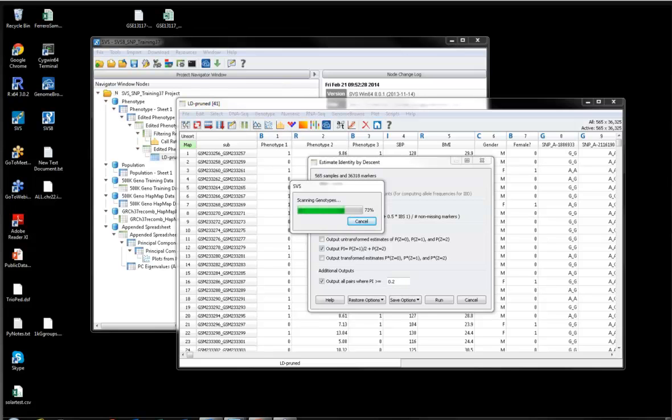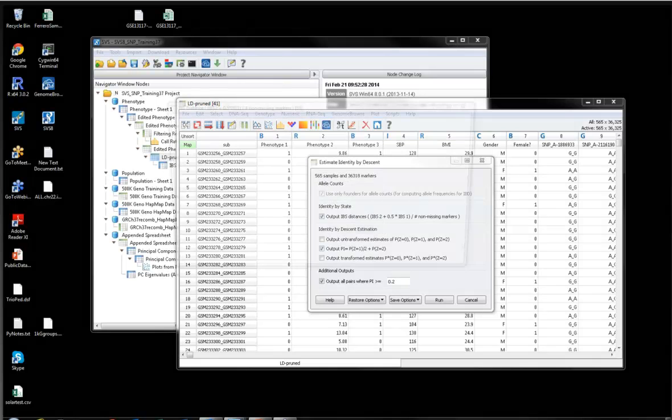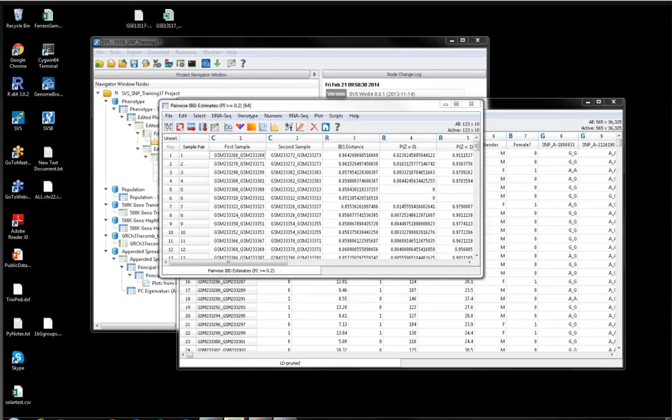But if you have data that's in Excel or in SPSS or SAS or other statistics programs, we can usually read those directly as well. I'll also point out that pretty much any format that we can read, we can also write to. And if you just need a software tool that allows you to read a VCF file and then export something in Excel, for example, you could use SVS for that. Obviously, there's a lot more functionality beyond just reading and writing different file types, but that option is there.